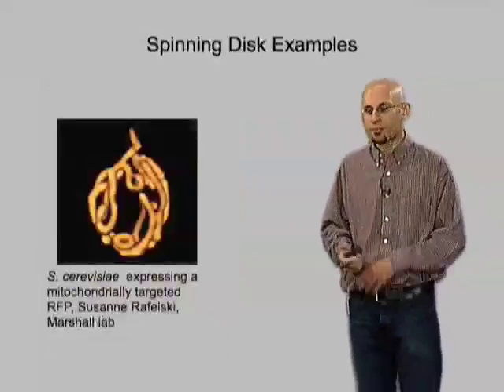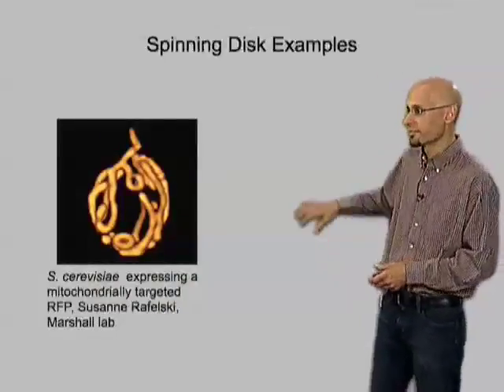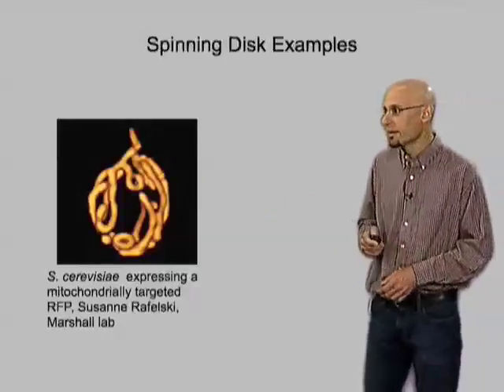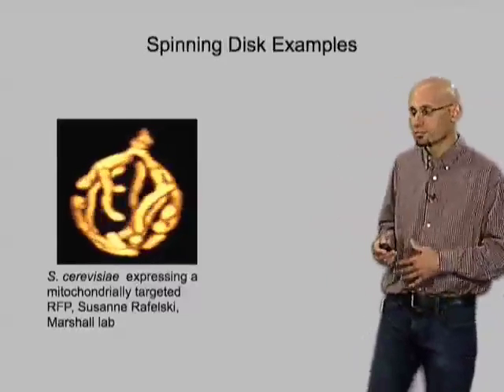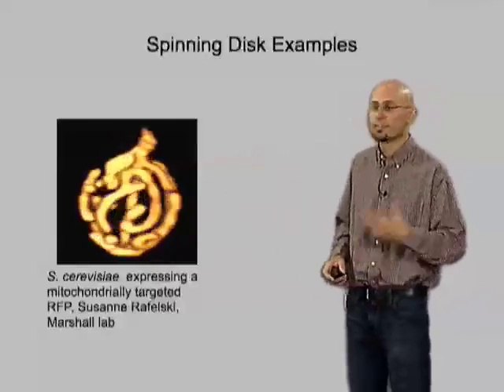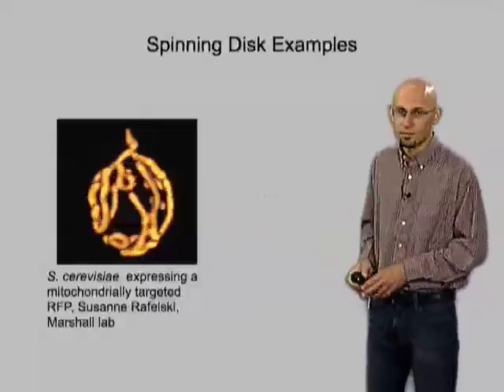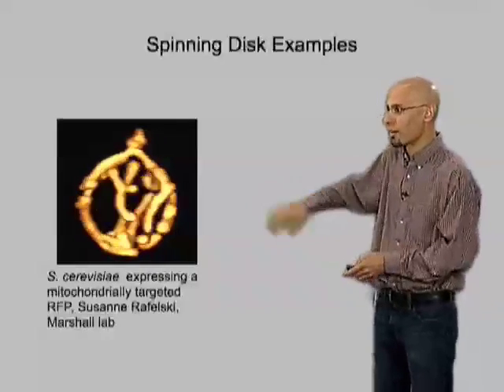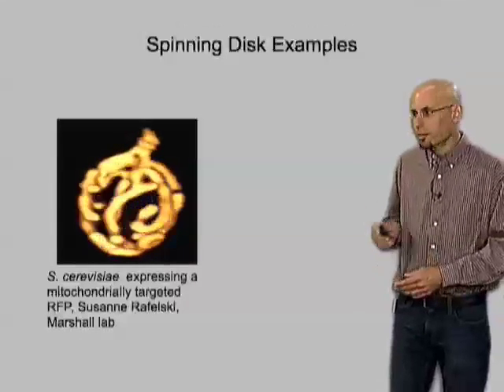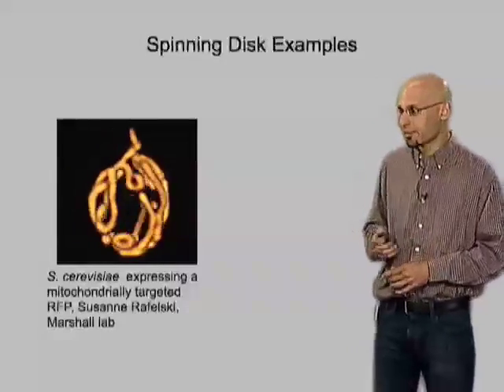Similarly, here's a three-dimensional reconstruction example. This is a brewer's yeast cell expressing a red fluorescent protein targeted to mitochondria, and this is a Z-stack of the kind we showed earlier, reconstructed in three dimensions. You can see the very intricate, detailed meshwork of these mitochondrial networks in this live cell, and this whole stack was acquired in maybe 30 seconds. So let's go to the lab, and I'll show you the spinning disk confocal and how it is put together.